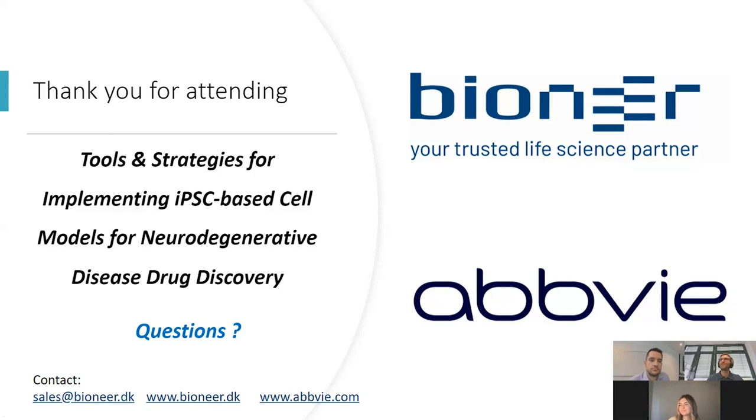Yeah, thank you for this one. The triculture model is something that we are very happy about, that we can play with it, so to say, but playing is not the right thing. You can imagine a lot of things. Just to give you an example, there is something called the disease-associated microglia. So one thing that we do is take these microglia under different conditions or expose them to different neurons, or differently, so quote-unquote, sick neurons, for example, and then see how this affects their possible disease-associated phenotype.